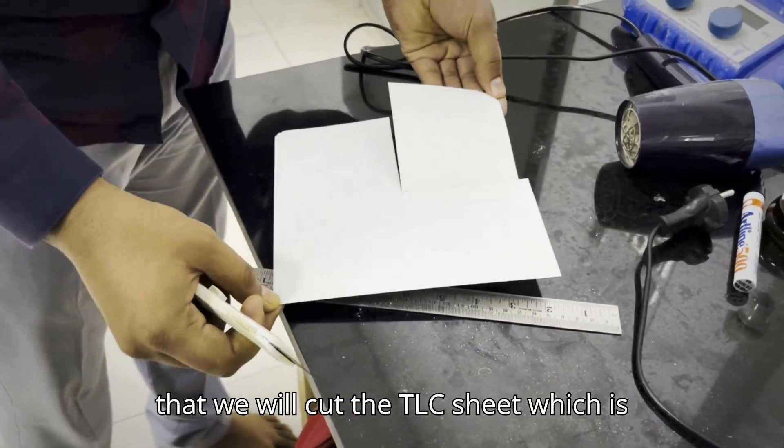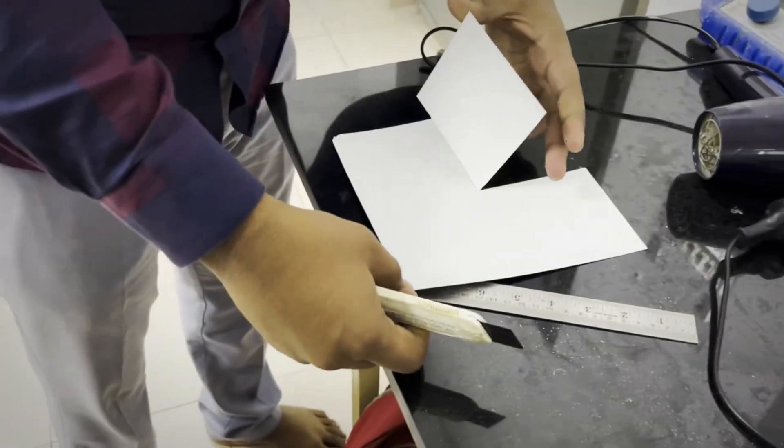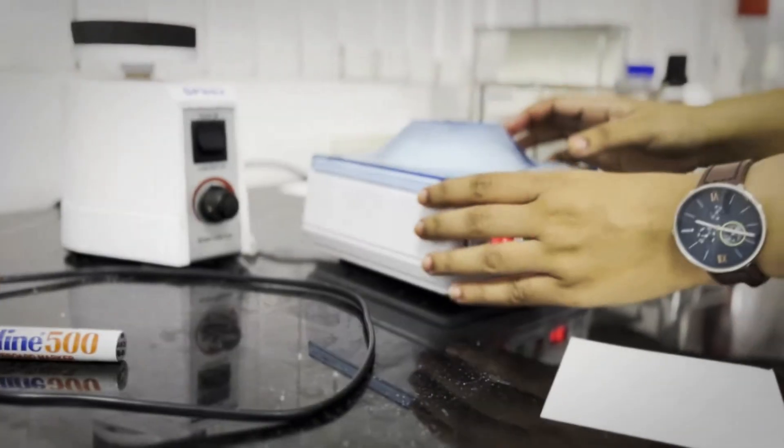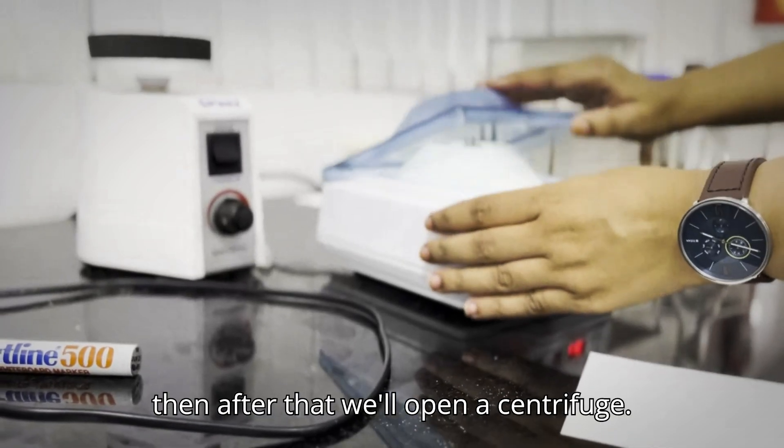After that we will cut the TLC sheet which is about 10 by 10. We will cut it in a square piece. Then after that we will open the centrifuge.